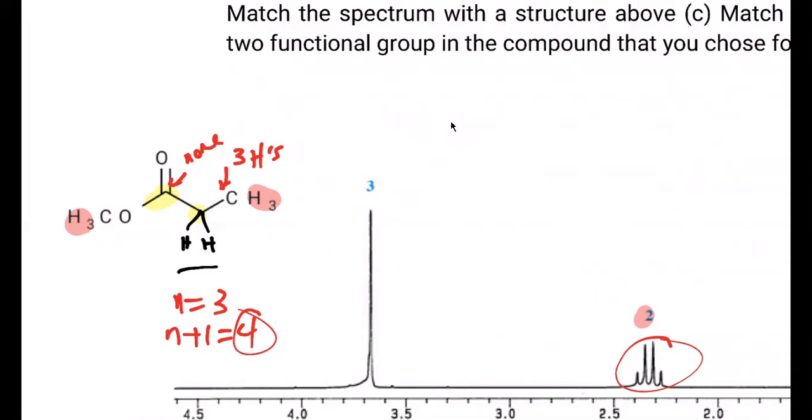So those protons are going to be shifted downfield. So remember what we said before, like what are the main takeaways from an NMR spectrum, right? So the first is the location, right? And that's upfield or downfield.